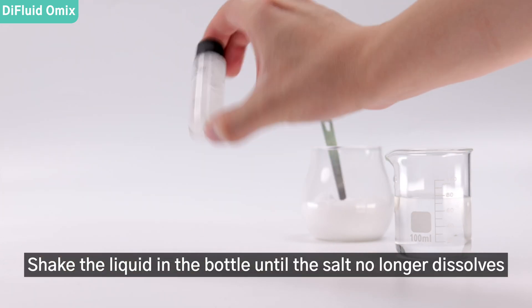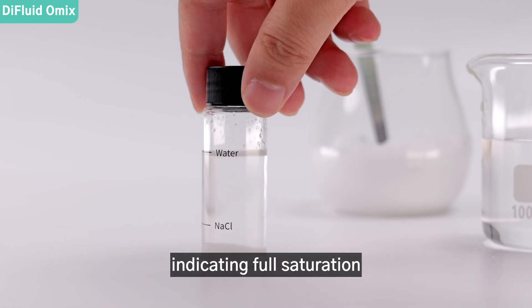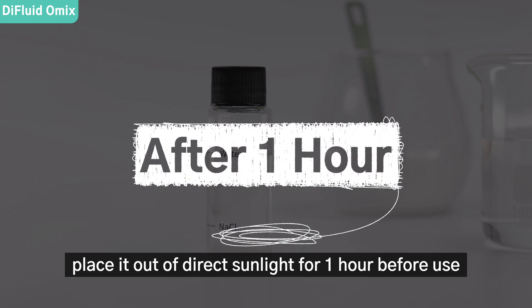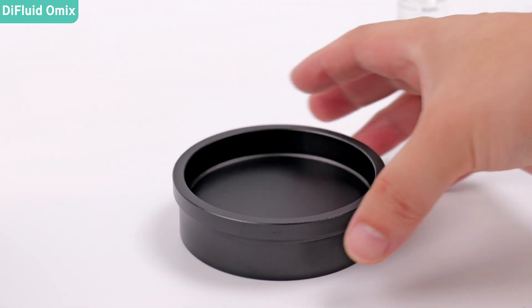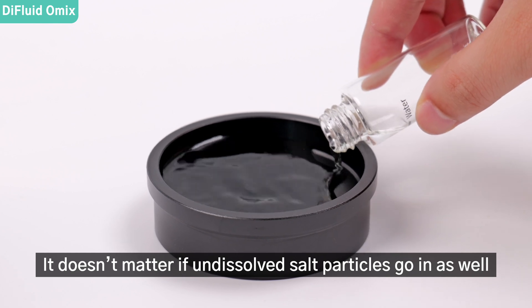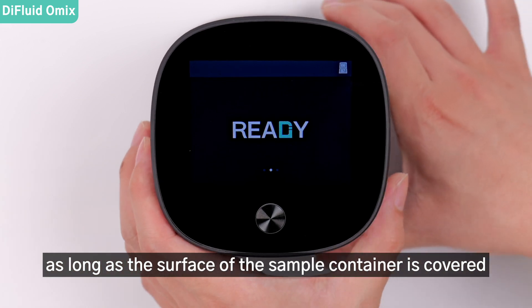Shake the liquid in the bottle until the salt no longer dissolves. It's better if there is some sediment left, indicating full saturation. Then place it out of direct sunlight for one hour before use. Pour the whole bottle into container B — it doesn't matter if undissolved salt particles go in as well.